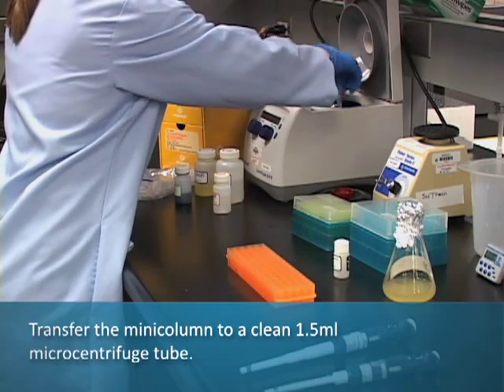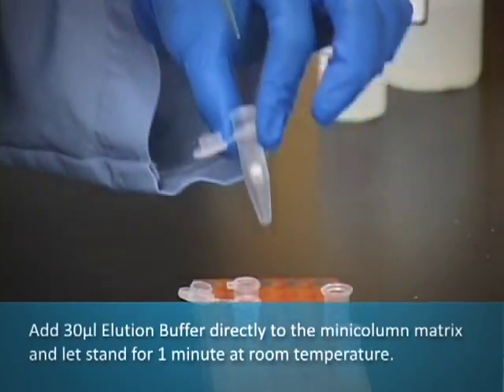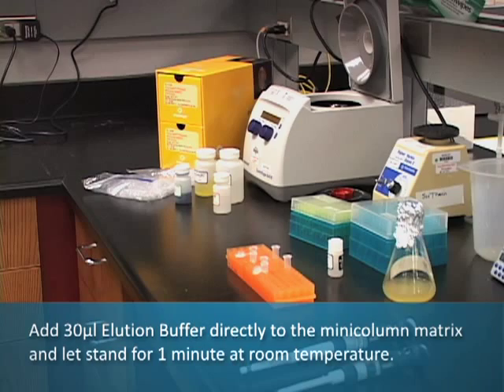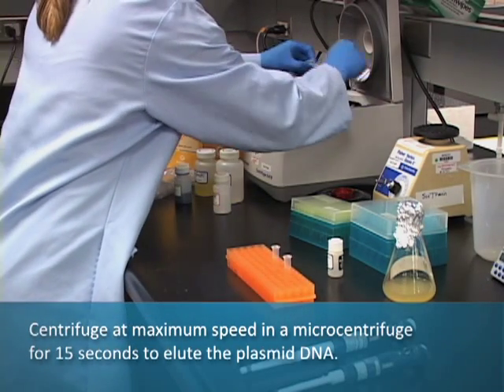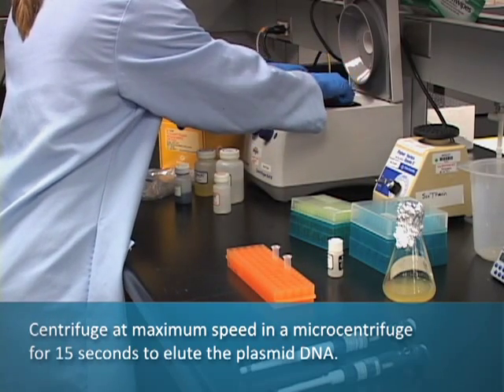Transfer the Mini-Column to a clean 1.5 milliliter microcentrifuge tube and add 30 microliters of elution buffer directly to the Mini-Column matrix. Let it stand for 1 minute at room temperature, then centrifuge at maximum speed for 15 seconds to elute the plasmid DNA.